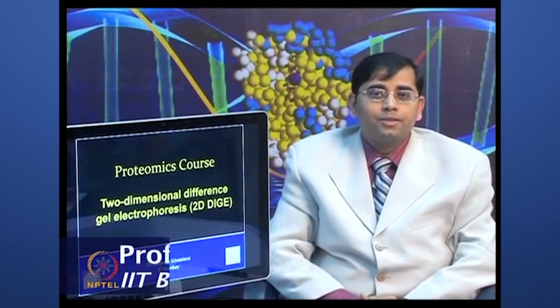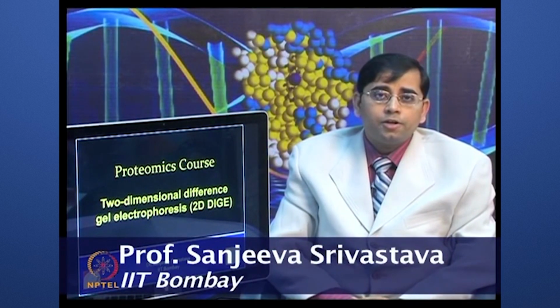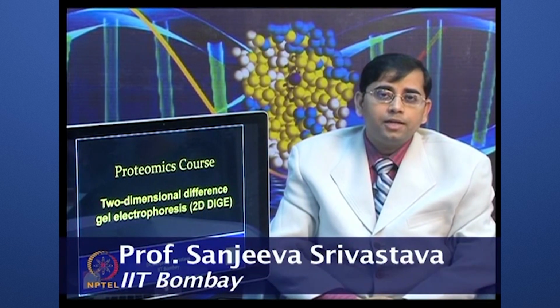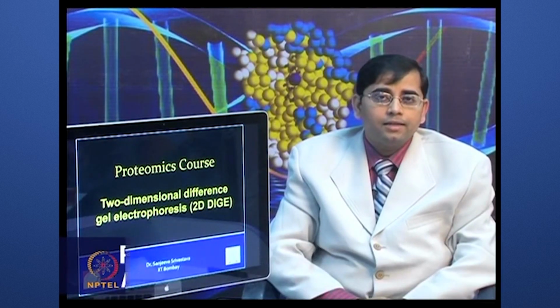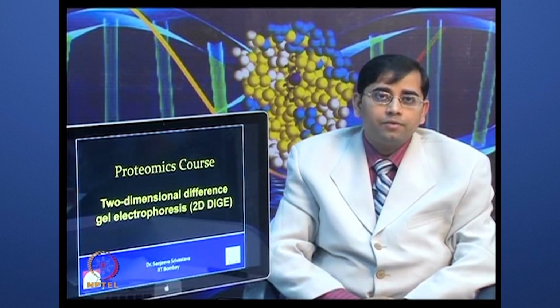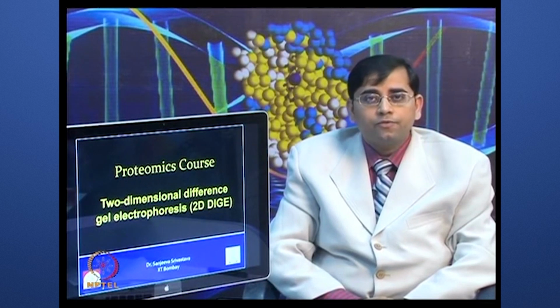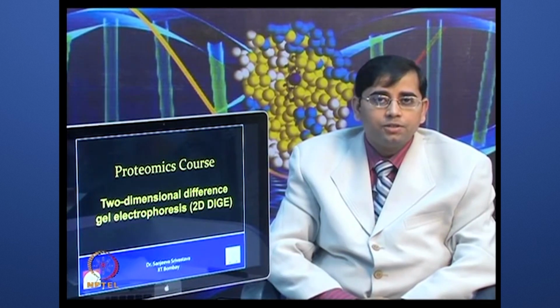Welcome to the Proteomics course. In previous lectures, we talked about the two-dimensional electrophoresis workflow, how to perform two-dimensional electrophoresis step by step. We discussed protein extraction, isoelectric focusing, equilibration, and second dimension separation by using SDS-PAGE.